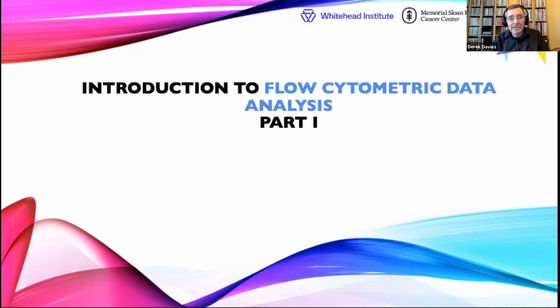Now, what we're going to talk about today is actually going to be relatively simple, I think, because I've been doing this for a large number of years. But we're not going to be doing high parameter t-SNE analysis or anything like that.